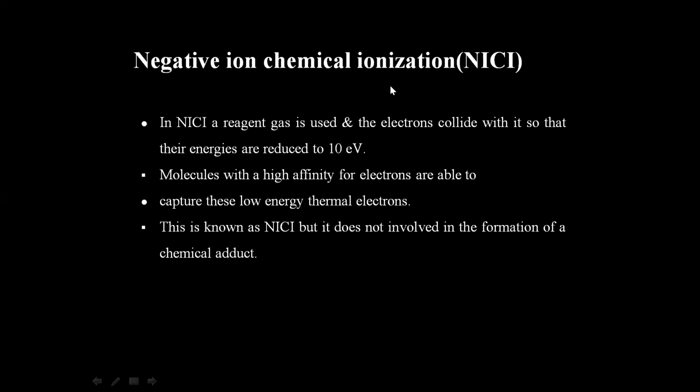Next is negative ion chemical ionization, which is abbreviated as NICI. In negative ion chemical ionization, a reagent gas is used and the electrons collide with it so that the energies are reduced to 10 electron volt. Molecules with a high affinity for electrons are able to capture these low energy thermal electrons. This is known as NICI, but it does not involve the formation of a chemical adduct.